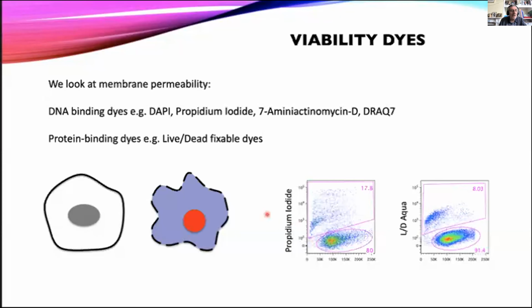However, in this particular experiment today, we want to quantitate the DNA. In order to do that, we're going to permeabilize our cells. We're going to fix them. And fixation would, of course, make these live cells also permeable. So I couldn't use a DNA dye in this case because everything would be positive. So in this particular experiment, we're going to use a different approach.